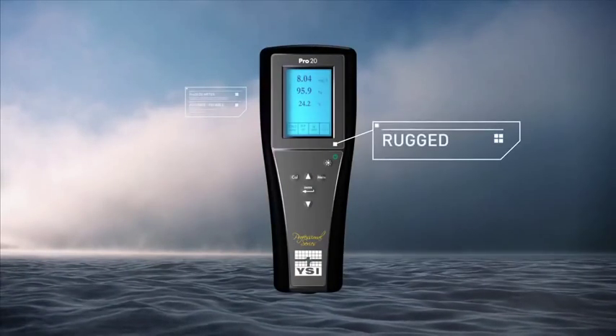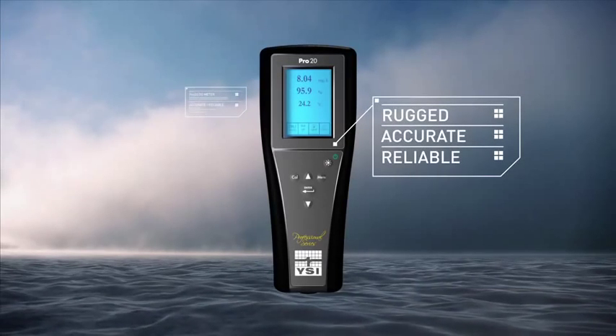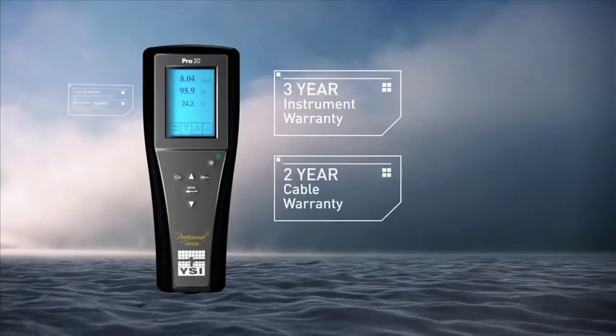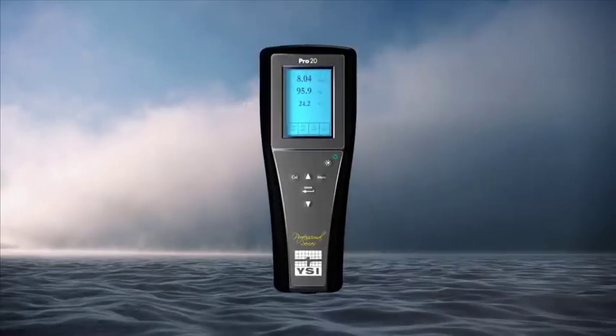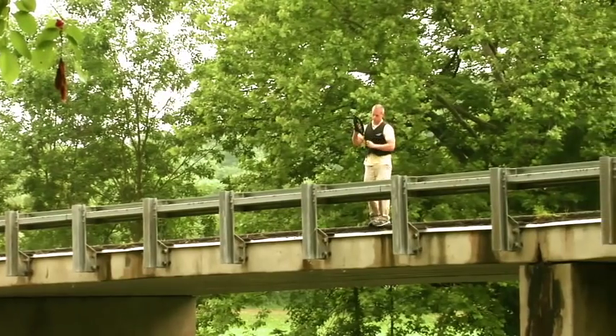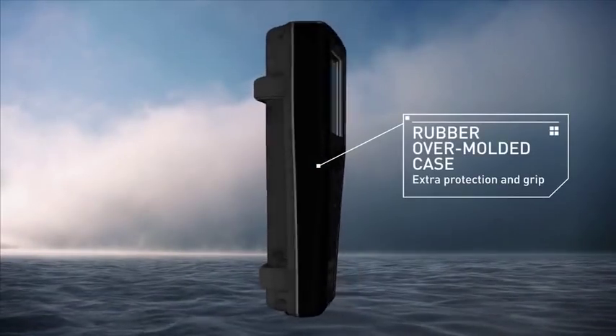All YSI products are rugged, accurate, and reliable. All Pro series instruments include a 3-year instrument warranty, 2-year cable warranty, IP67 waterproof rating, rugged military spec connectors on all meters, a 1-meter drop test rating, and a rubber over-molded case.